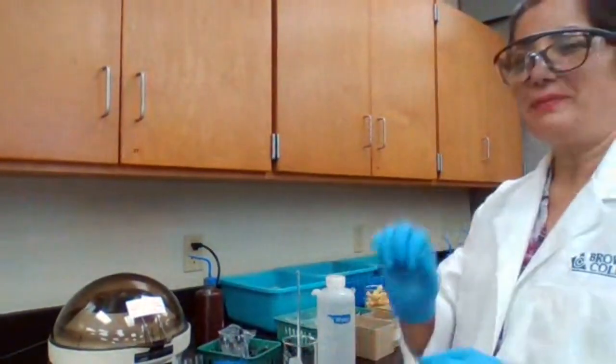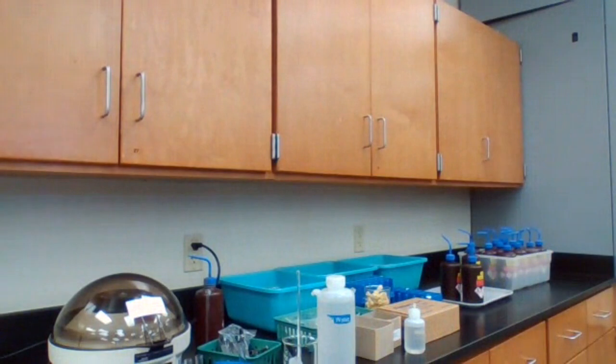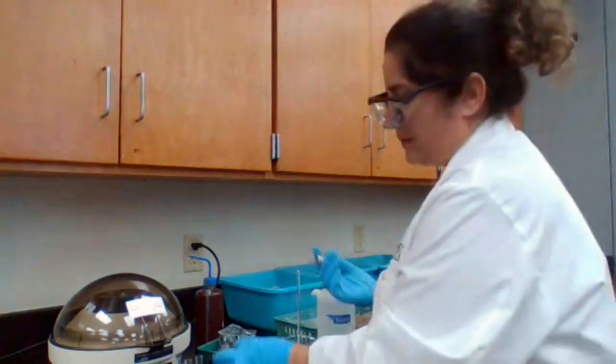I'm going to bring some labels. I'm going to actually label my test tubes before I forget which step I need to use them for. I should be fine, but I don't want you to get the bad habit of not labeling.